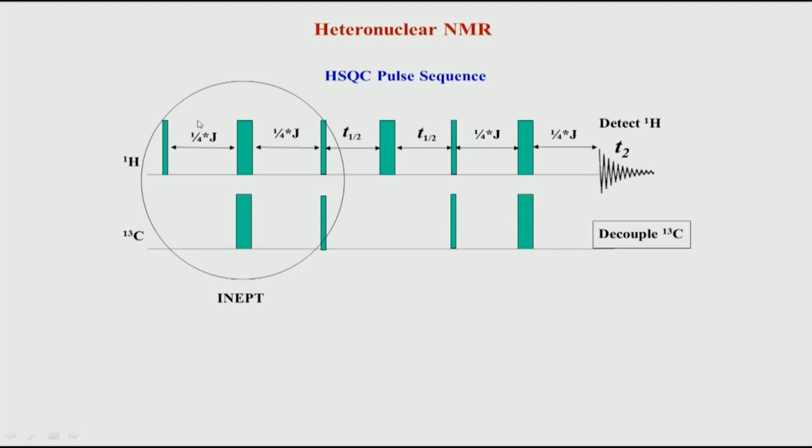This is like a blueprint of the experiment which is conducted in a 2D experiment. For an expert, all the information of the experiment is contained in this diagram. Of course, this is not a complete diagram on its own; details are omitted here which we are not going to go into, such as the phase cycling and the values of delays, but overall this picture captures how this 2D NMR experiment is implemented.